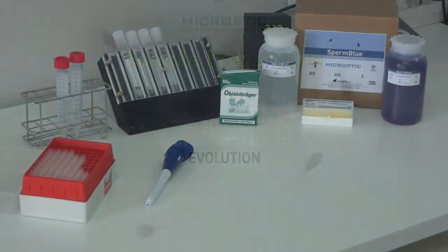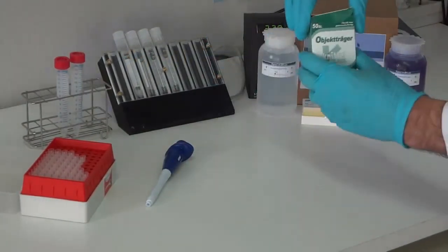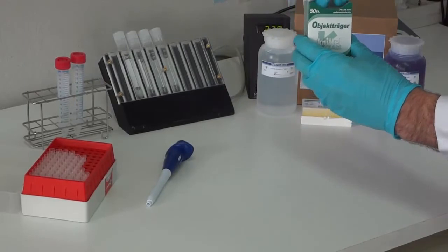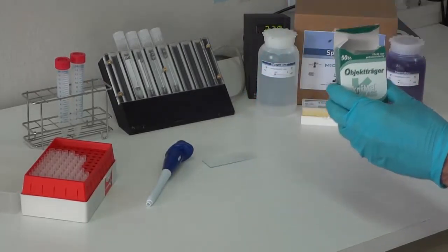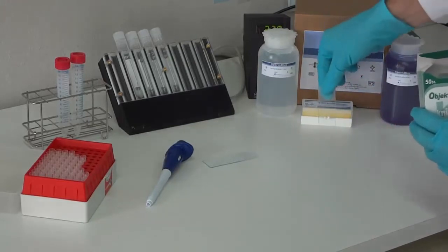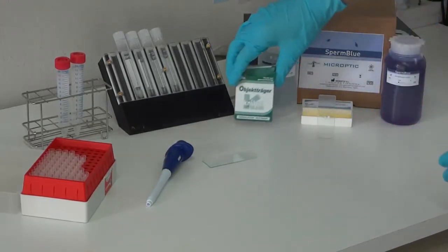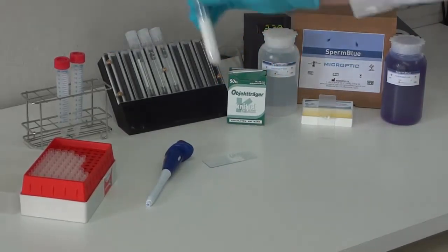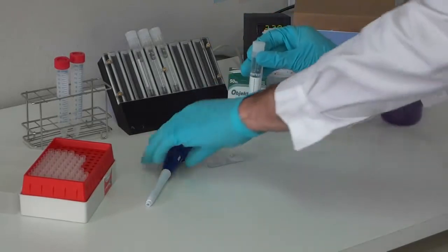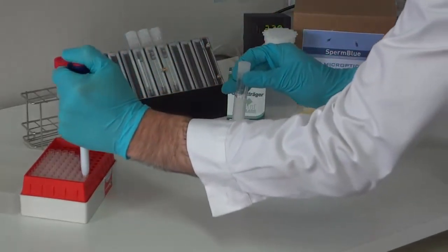Morphology sample preparation. Morphology analysis requires the staining of the semen sample. Sperm Blue, Diff-Quik, Papanicolaou, or Shorr are also appropriate. First step is to do a smear. Apply a 5 to 10 microliter aliquot of semen, depending on sperm concentration, to the end of the slide placed in horizontal position.